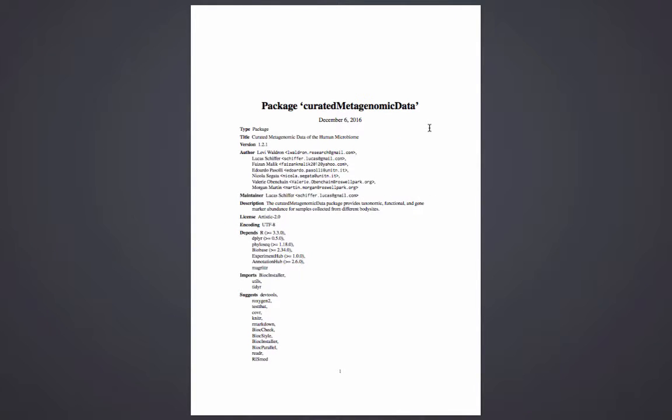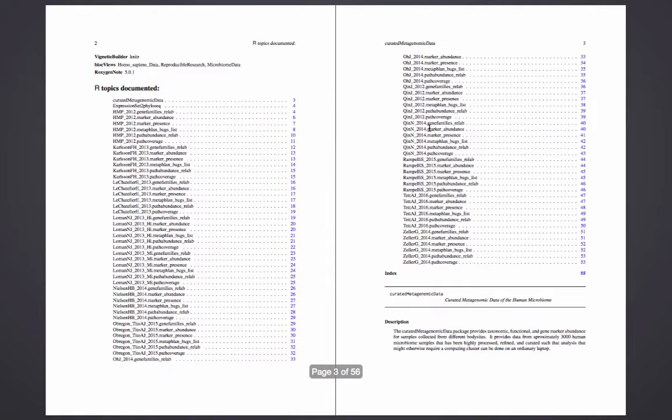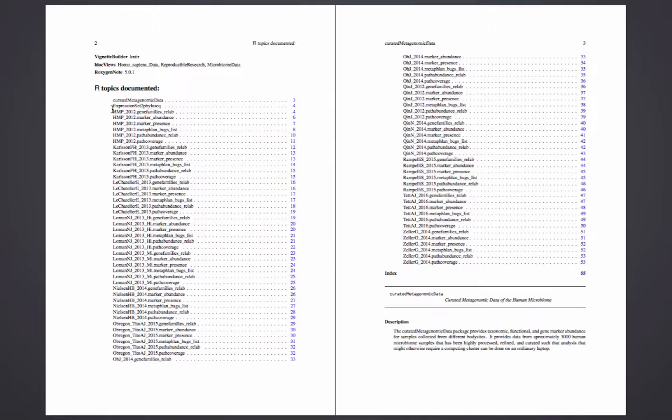A quick look at the package's manual shows how to access these datasets. There are six convenience functions provided per dataset corresponding to those six data types. So I'm going to take a look at the one that probably most people will want to use, the MetaPhlAn bugs list.